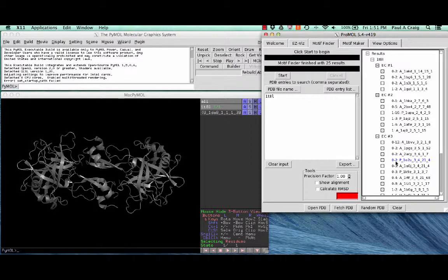This term 0 to 2, that's the Levenshtein distance. The Levenshtein distance is how similar the sequence that you're comparing, or the residues you're comparing, are to the residues in the template. So if it's a value of 0, that means that it has exactly the same number of residues and identification of residues in the query structure that are found in the motif template structure. And in this case we have 0 to 2, and so it's 0 if you compare it a certain way. If you look other ways, it's possible you might actually have 2 changes between those two.